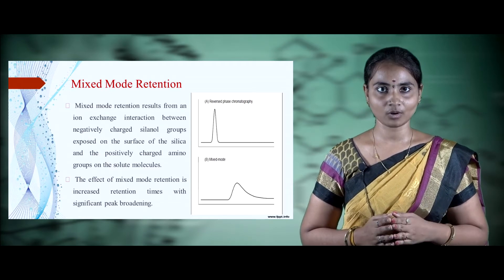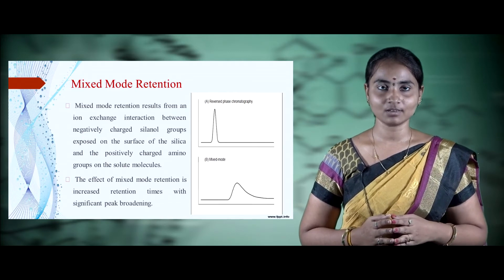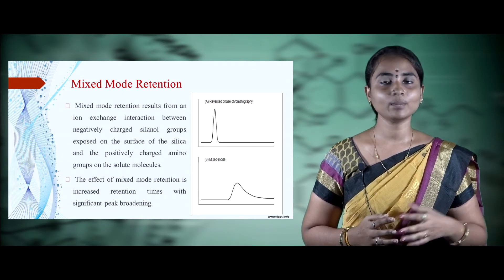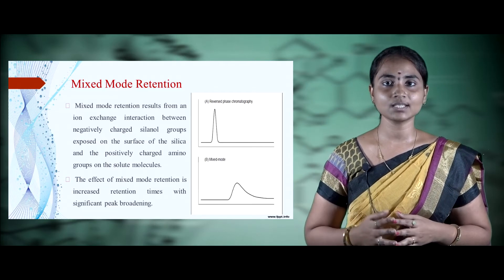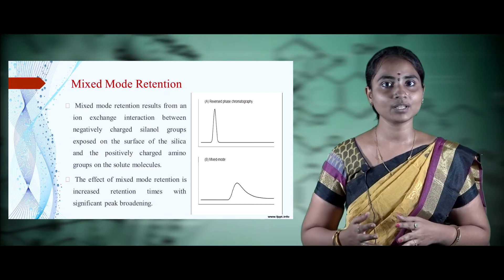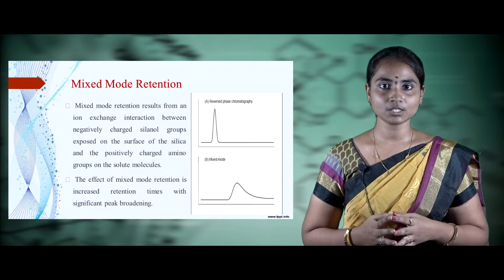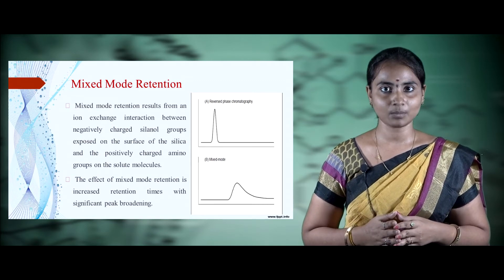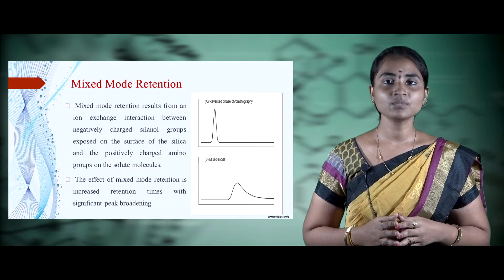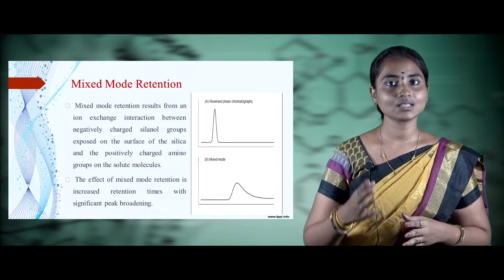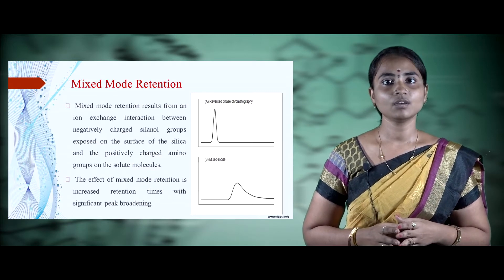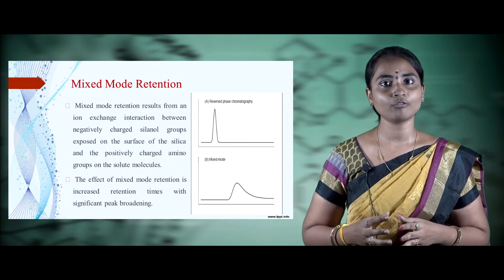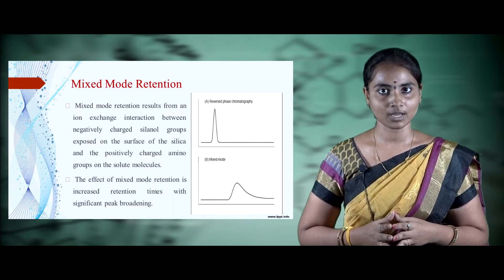Reverse phase chromatography highly focuses on retention of isolated molecules inside the column, particularly mixed mode retention. Mixed mode retention results from ion exchange interactions between the negatively charged silanol groups on the silica matrix and the positively charged amino groups on the components to be purified. This mixed mode retention increases retention times with significant peak broadening, as shown in graphical representation — reverse phase chromatography shows a sharp peak with less retention time, while mixed mode retention shows a broad peak with increased retention time.